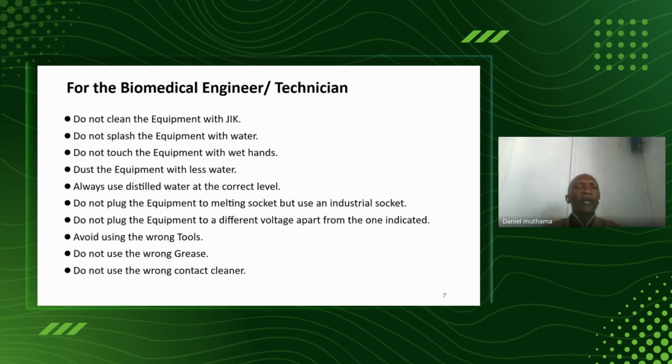For the biomedical engineer or the technician who is coming to repair, do not clean the equipment with jik. As we say, jik is corrosive. Instead, here you can use 70% alcohol for disinfecting the equipment. Do not splash the equipment with water.